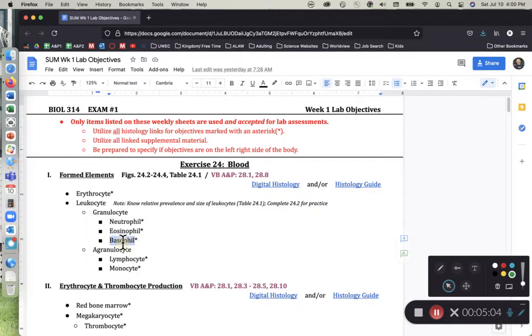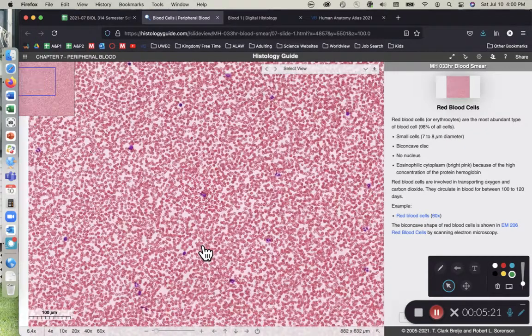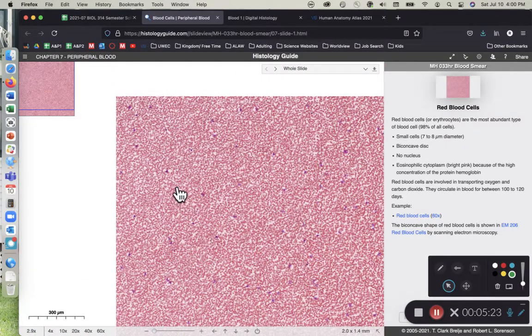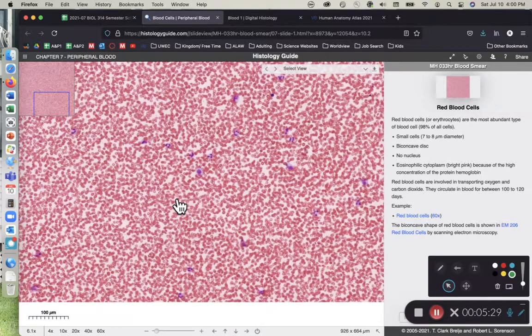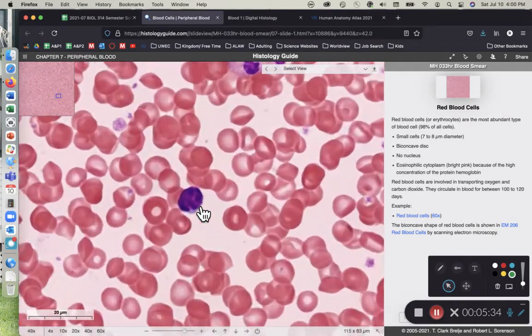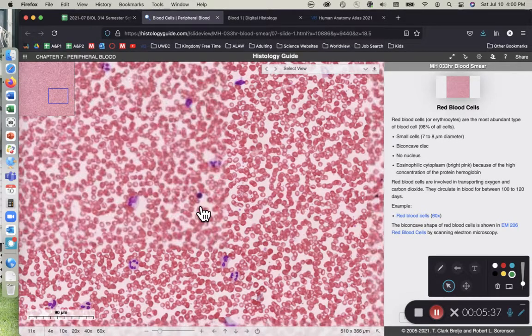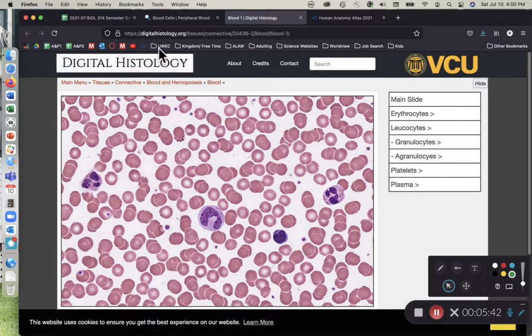Our next leukocyte is the basophil — our last granulocyte. All the granulocytes end with the suffix '-phil.' The basophil is going to have granules and will appear very dark purple. It's also the least abundant of all leukocytes, so it's a little bit harder to find. I'm going to use the digital histology site, which is a great resource that pre-labels everything for you.